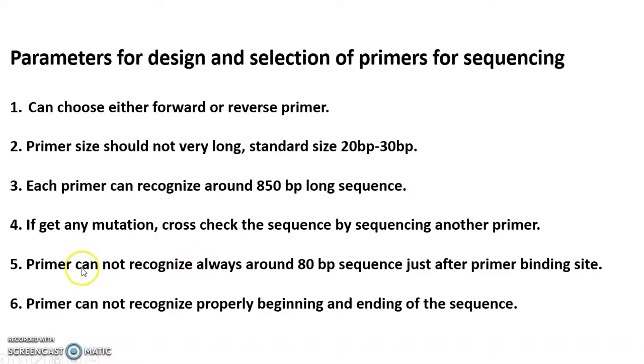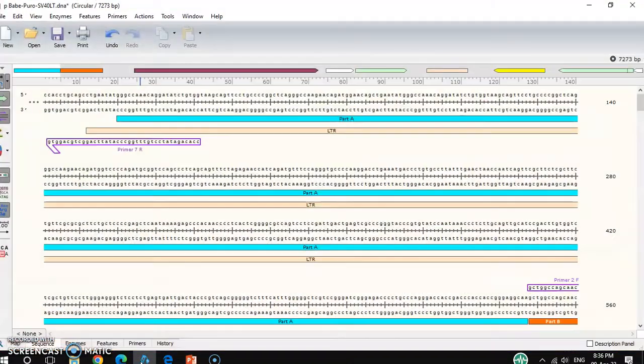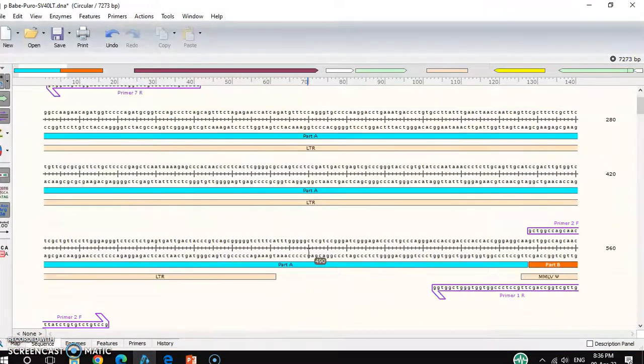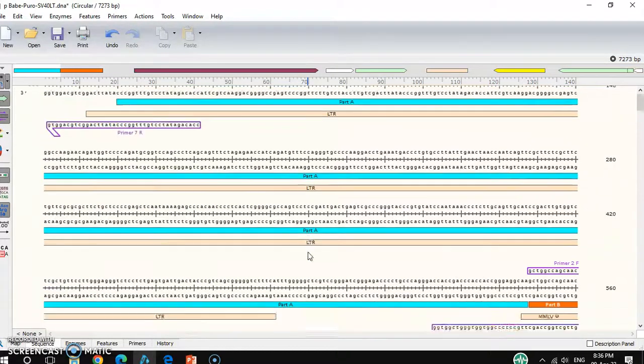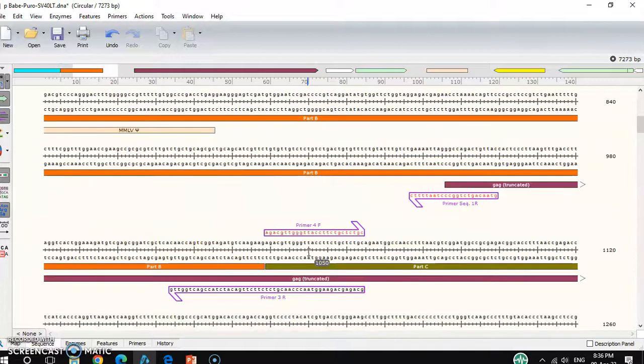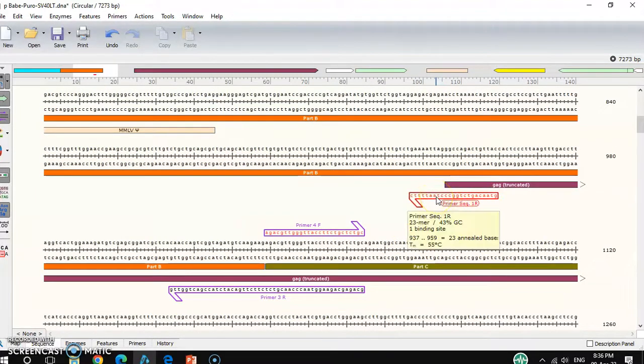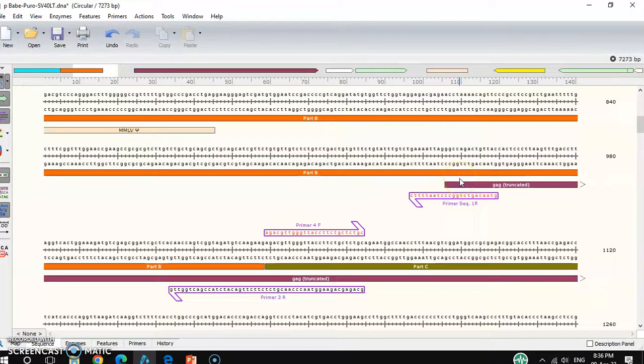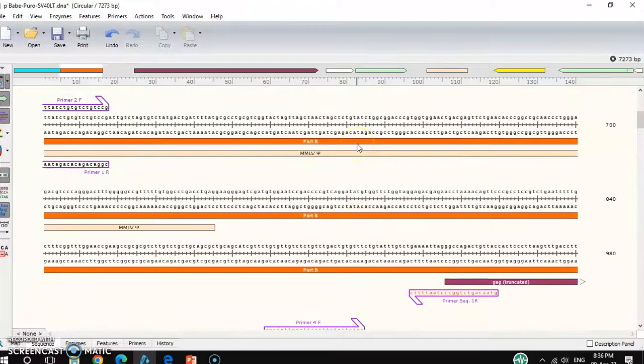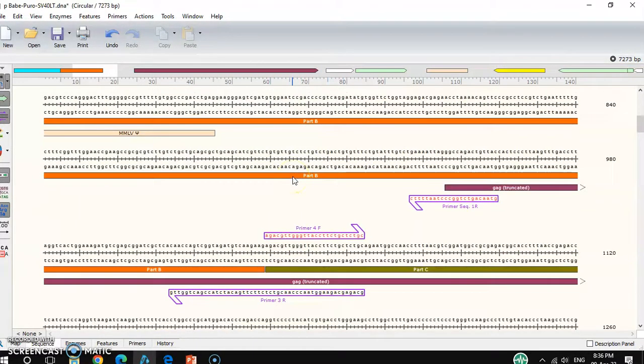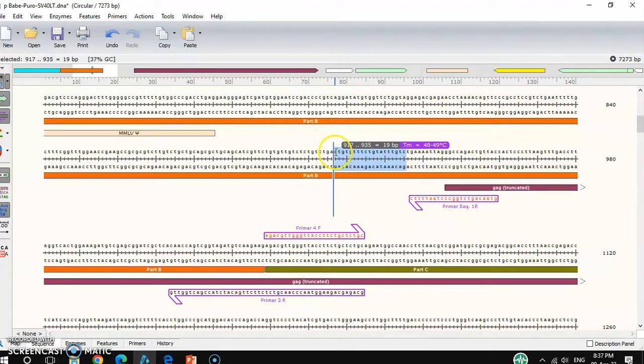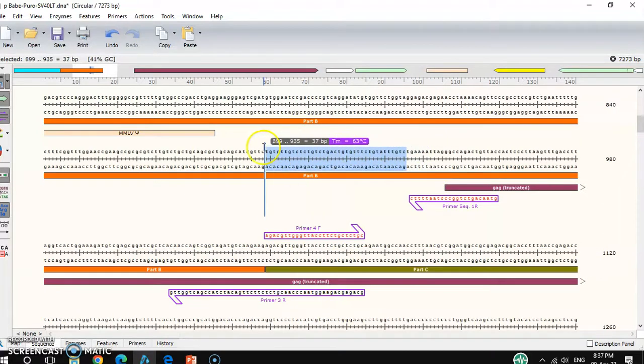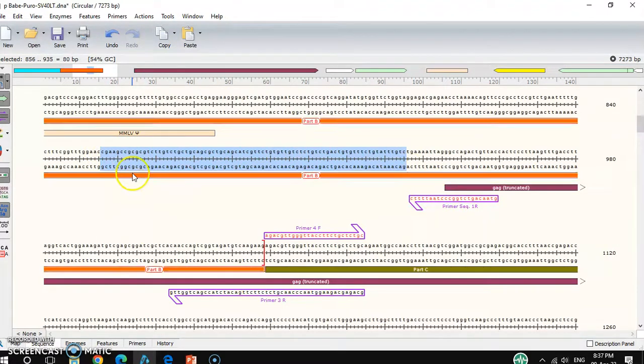Also, the primer cannot recognize always around 80bp sequence just after the primer binding site. For example, I'll show you here there are some primers. This primer, when I design this primer and I would like to sequence this 5 prime to 3 prime part, you see the primer binding site is here. From here, around 80bp long, this primer cannot recognize properly.